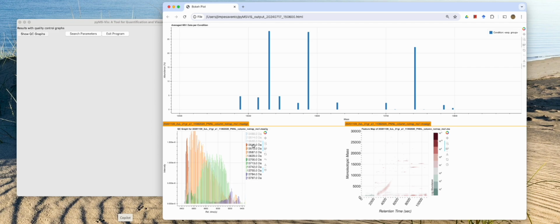You can click these masses and turn them off to get a better view. Oh cool, look at these higher masses of H2A eluting over there. Oh, these masses are eluting over here, quite a bit of a difference. Interesting. So this tells you more about how your ions, proteins or peptides behave as they come off the column.